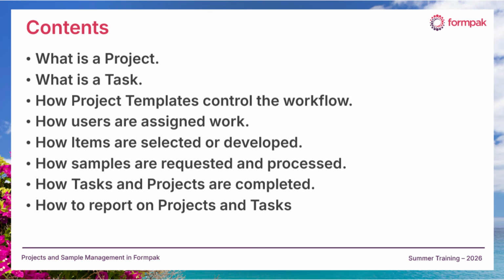We've used My Ready Tasks to find assigned work. We've looked at finding matching items and baskets to support product selection. We've created a formulation using the CDT. We requested samples, we looked at manage samples produced, we completed the sample task and closed the project, and we also looked at search for projects, search for tasks, and also looked at reporting on samples as well.